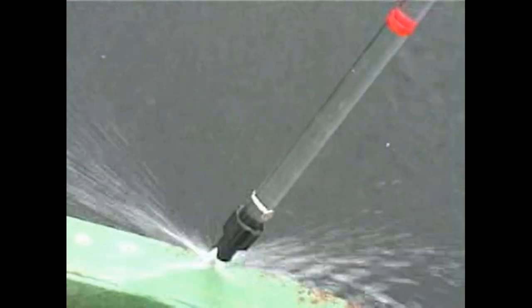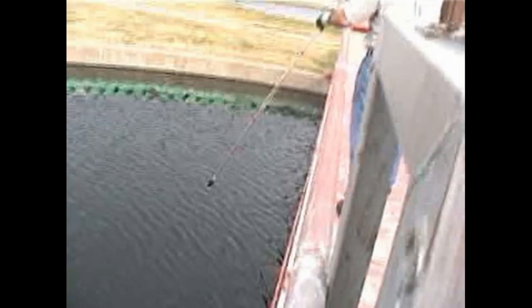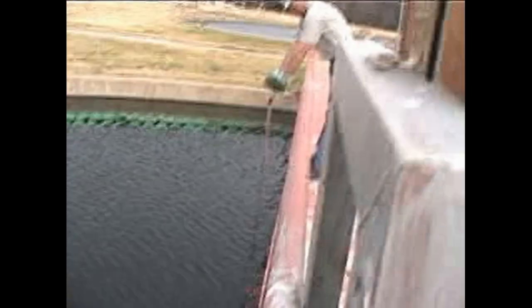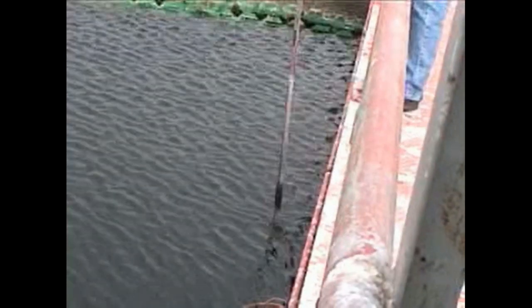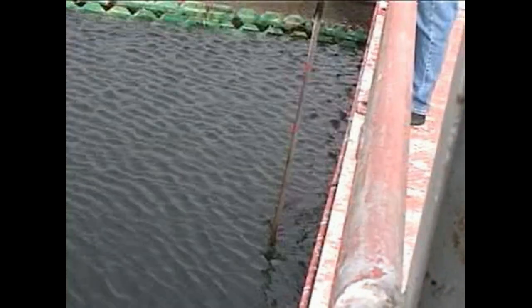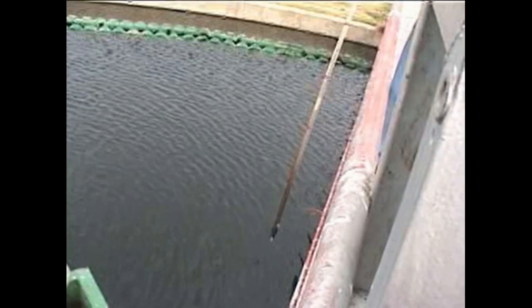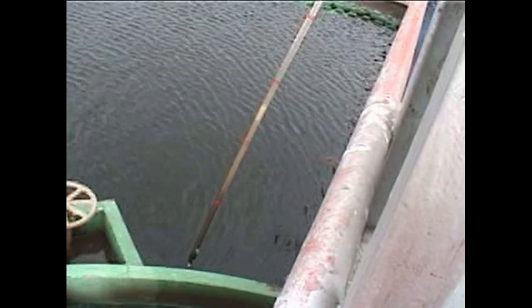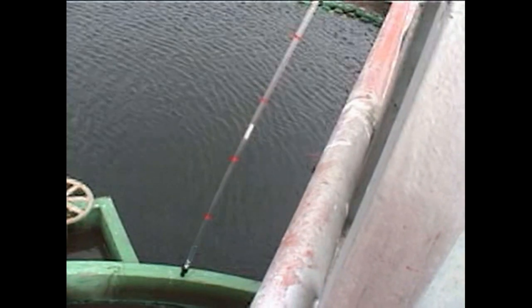So as a result, what can happen is, and notice there was just a couple of inches of sludge in that particular measurement. But depending upon the speed with which you put the instrument down in the water, notice he's going in much faster now, what happens is because of that constriction, it doesn't allow the water and material to flow up into the tube as readily. So it gets to the bottom of the tank, and then the water inside the tube equalizes with the water outside the tube. And what it's doing is sucking up sludge from the bottom of the tank. And as you can see, there was over a foot of sludge in that measurement.